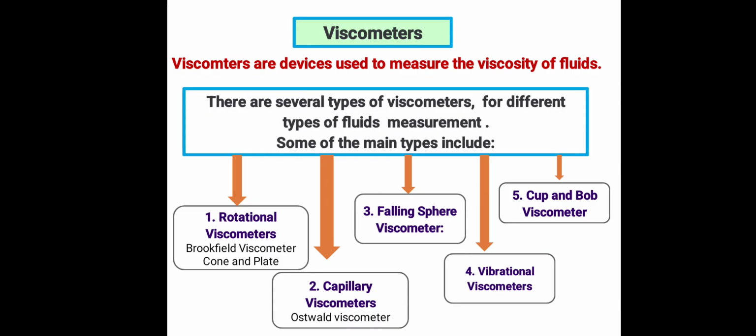Next, cone and plate consists of a cone placed above a flat plate. The gap between the two is filled with fluid, and the torque needed to rotate the cone is measured. Torque means a measure of force.